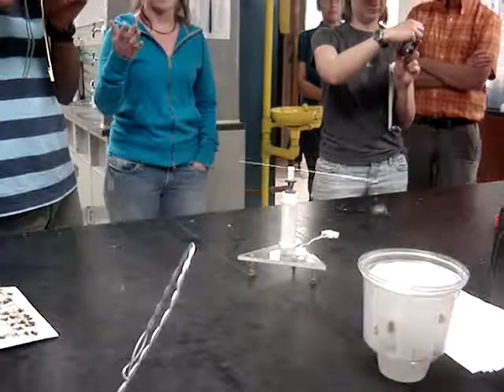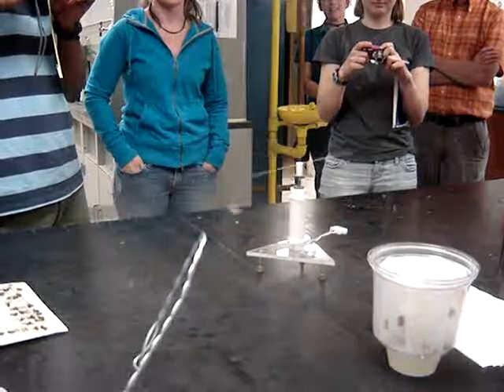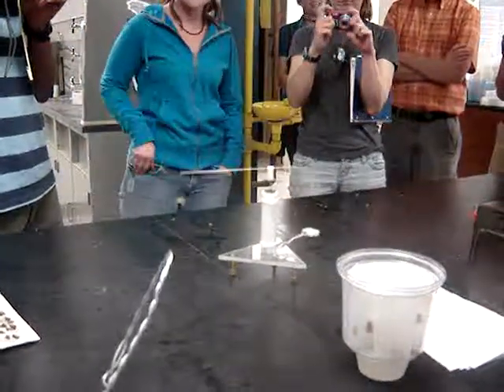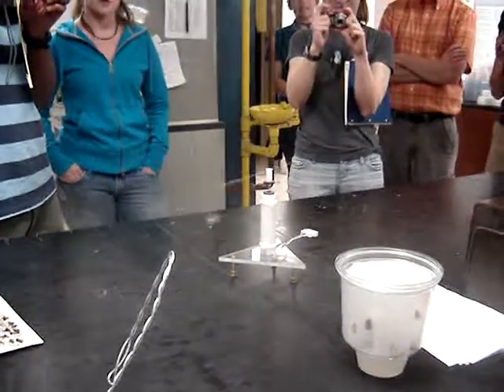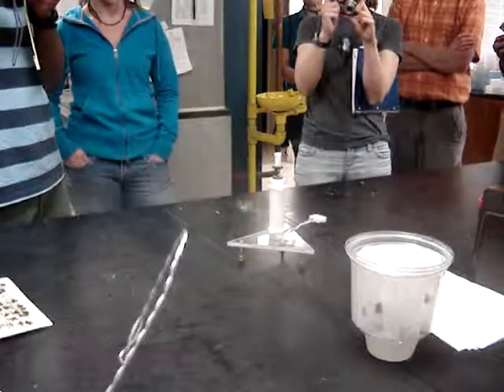They fly like this — how do you fix them to the mill? They're alive, yes. The way of sticking them to this is they're attached by an insect pin. First I have to freeze them to calm them down enough so that I can actually pin them.